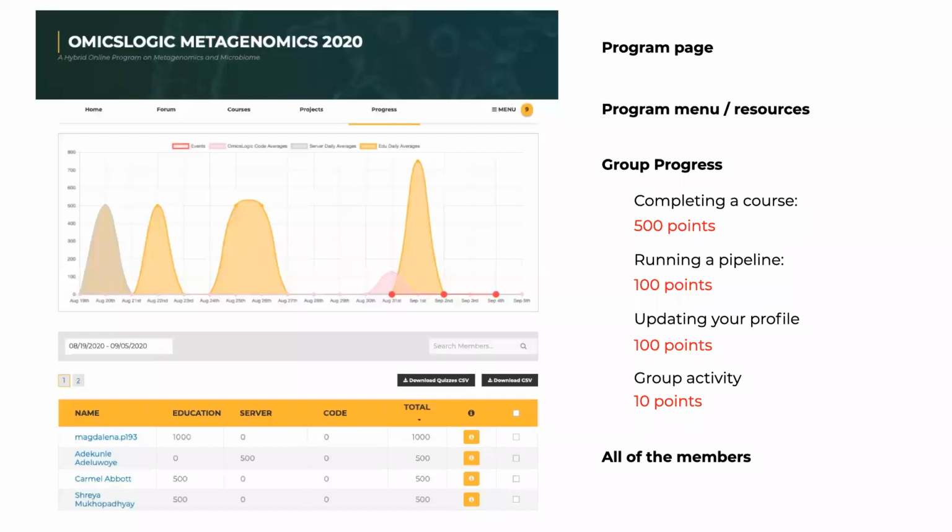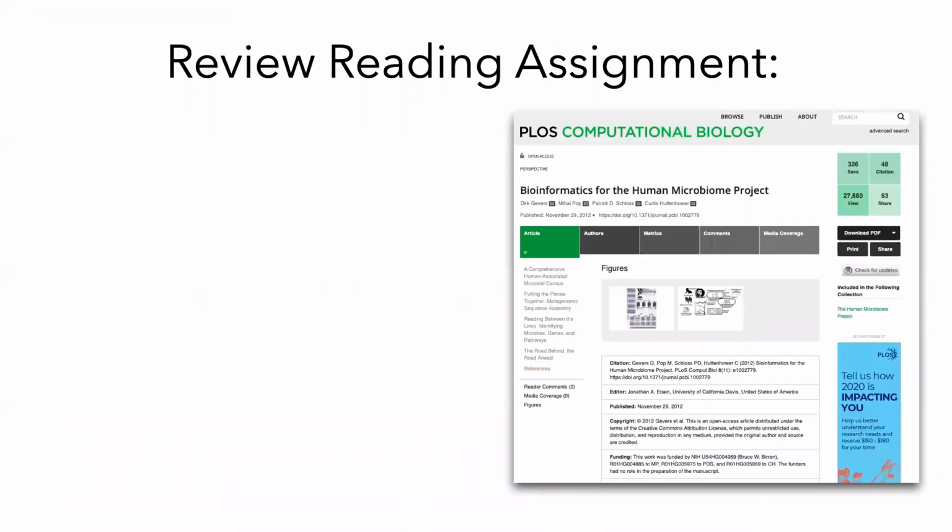There are also scripting challenges or some things that are just easier to do using scripting. So we're going to briefly look at that today and hopefully just do a little bit of an introductory kind of a lesson that all of you, I hope, can complete, understanding how this fits in to the overall program.